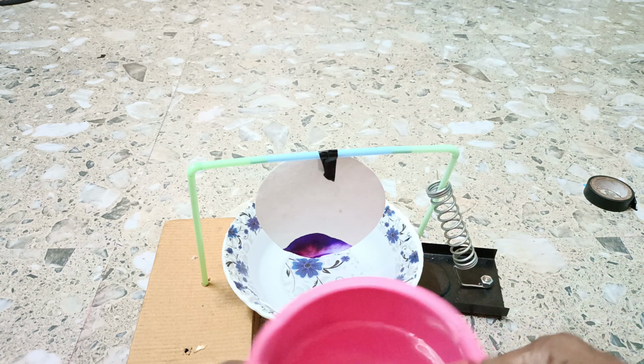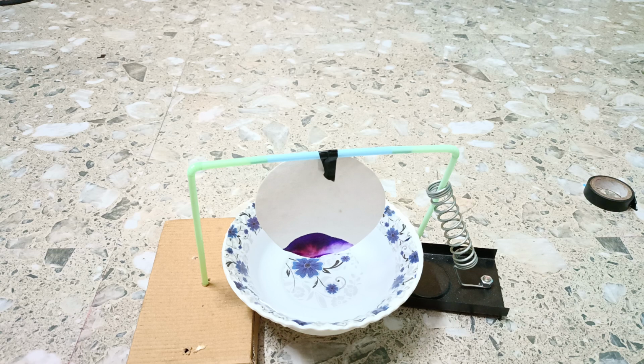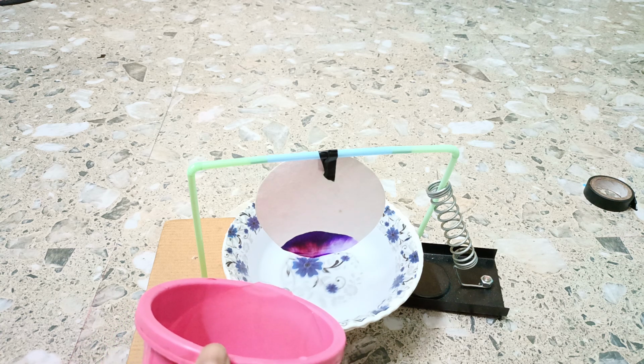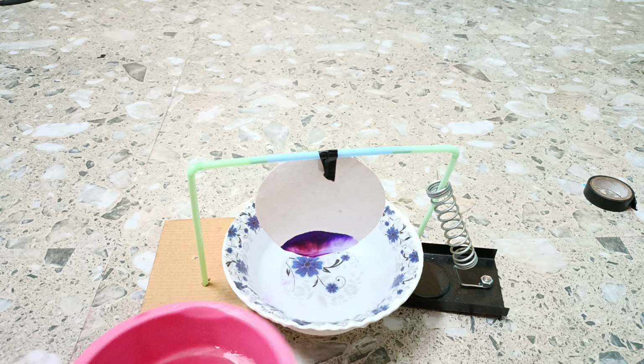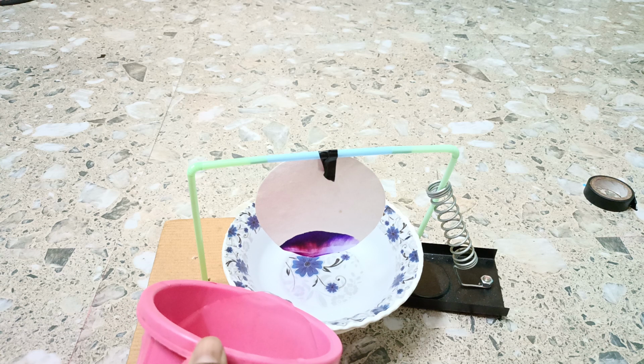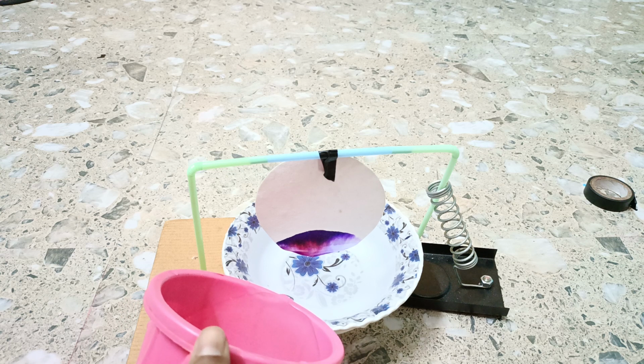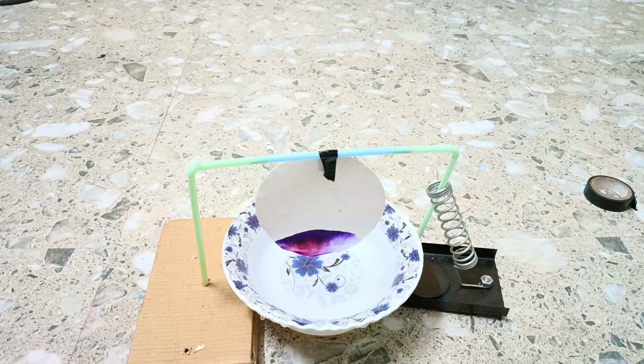Here we have added water and it will take some time such that the blue color and red color will separate out. You see how the red color and blue color are separating from each other, and you can separate the blue color and red color in this chromatography experiment. See here we have added some water, we'll add some more water. You can see it will take some time.